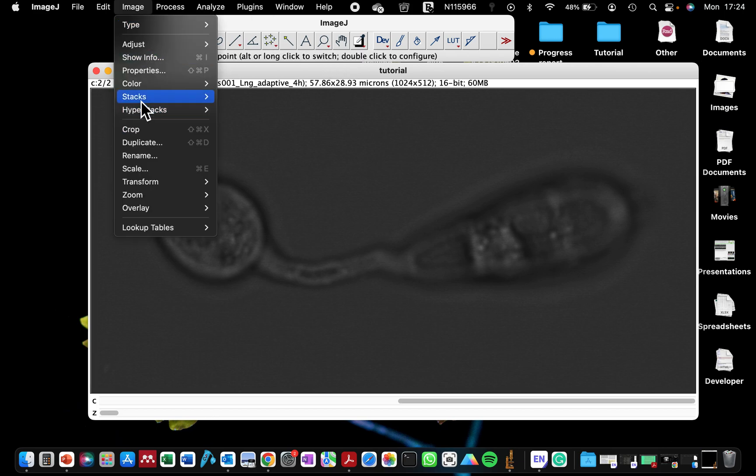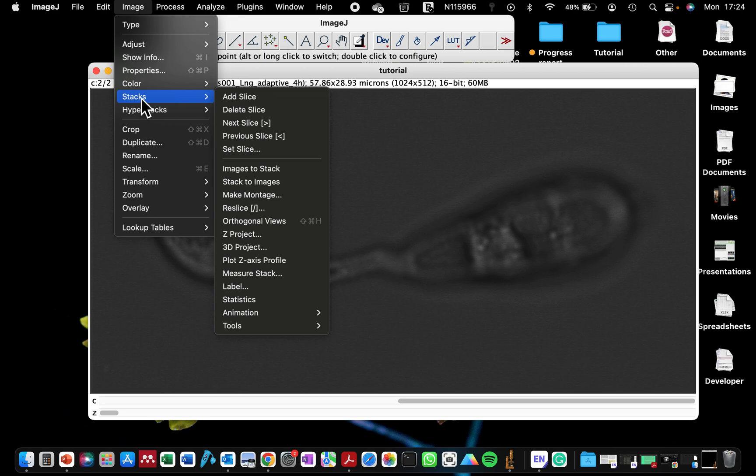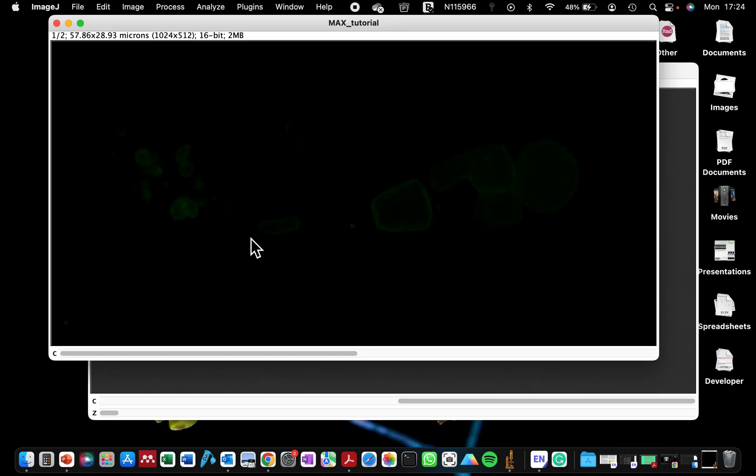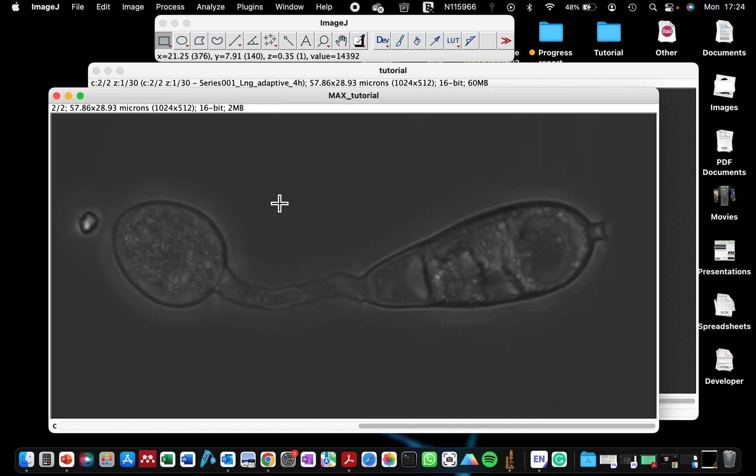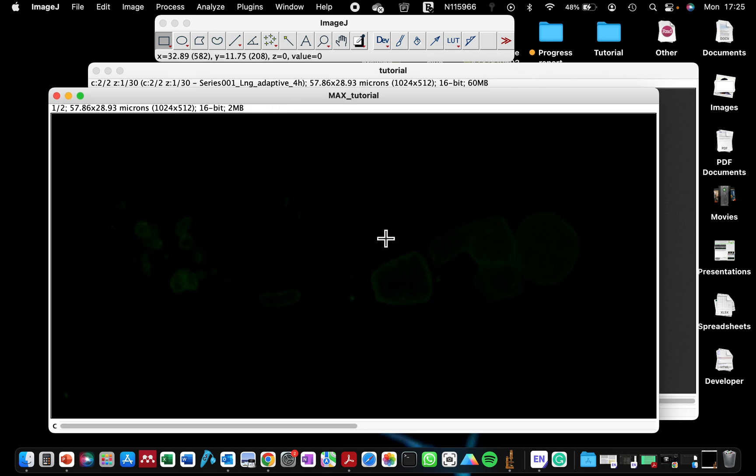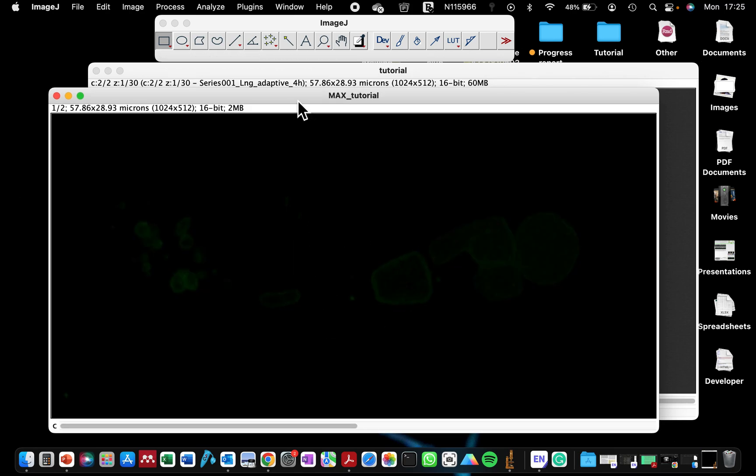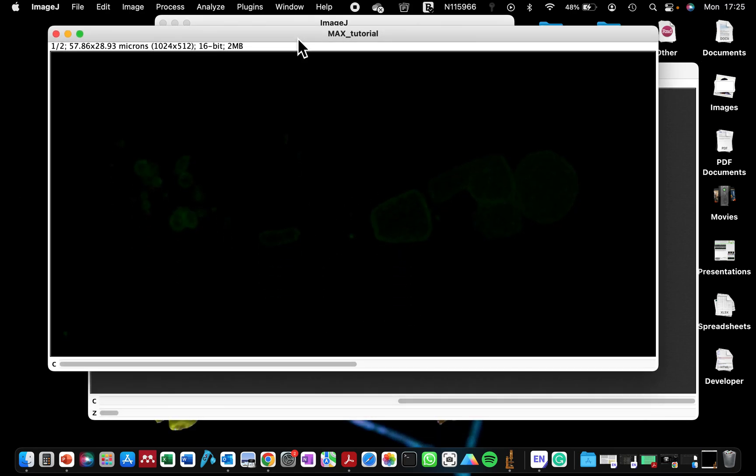So if we go to Image, Stacks, Z Projects, and we make our Z stack, you can see that my fluorescence image is barely visible. However, on the confocal microscope, it was brighter than this.